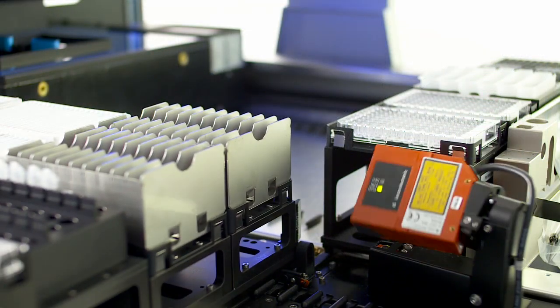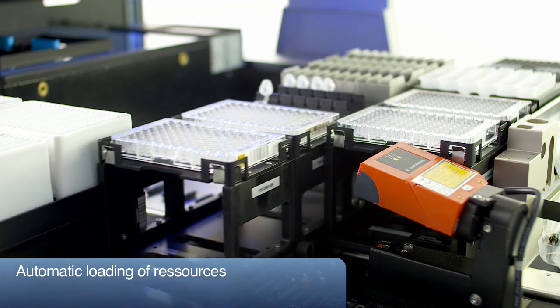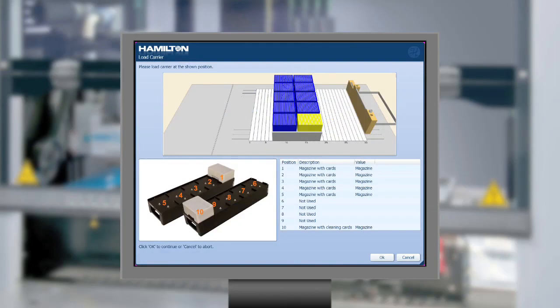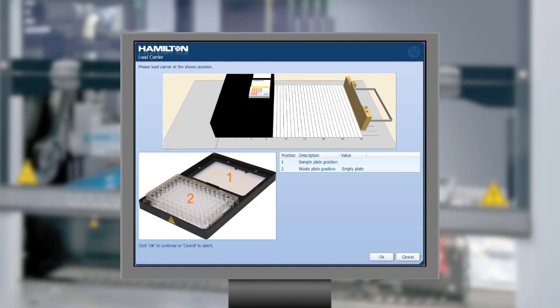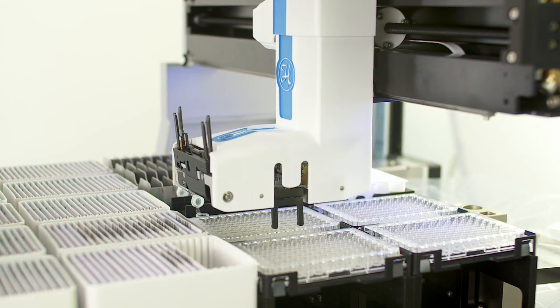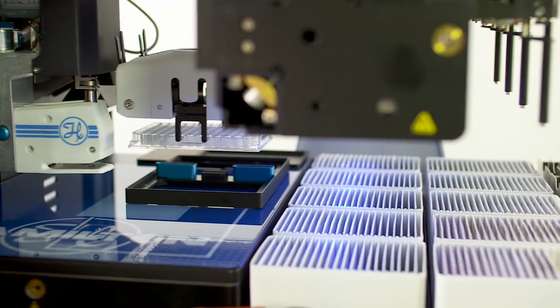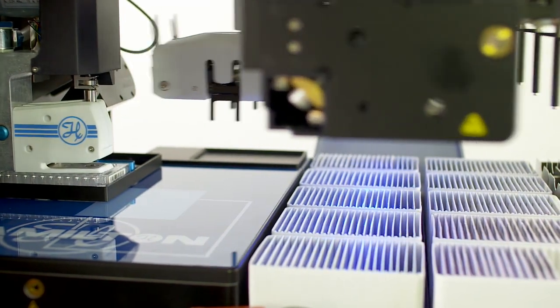The system supports automated loading of multiple resources required on the deck, such as magazines holding the sample cards, plates, tips, and reagents. An interactive dialog confirms that each resource is loaded to the right position. The target plate is transported from its position on the deck to the punching station by a special gripper on the robotic arm. It is then placed on a plate slide moved by magnetic connections.